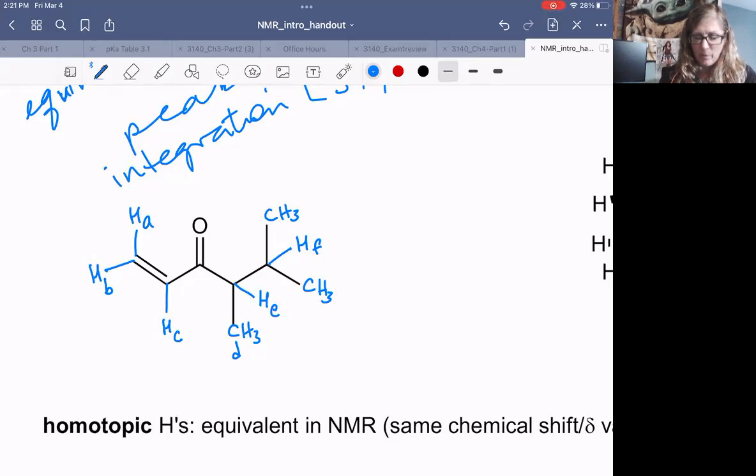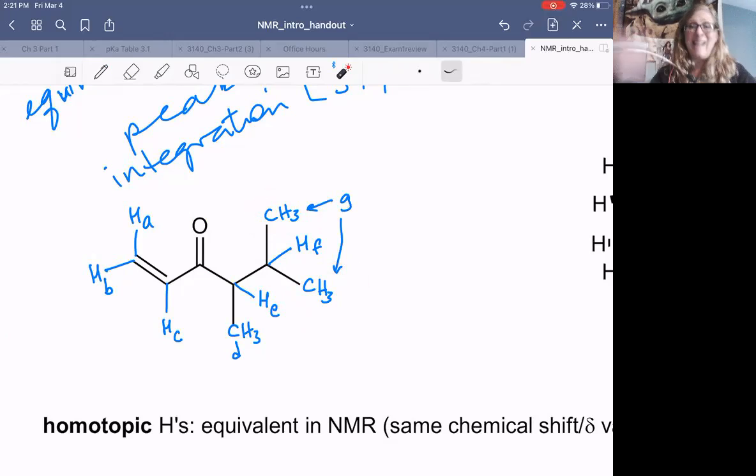And so all 6 of these protons will occur as a single signal. Now sometimes when we say that protons are equivalent in the NMR, it's because that little substitution test gives us the exact same compound. Other times that substitution test doesn't give the exact same compound, but gives enantiomers instead.